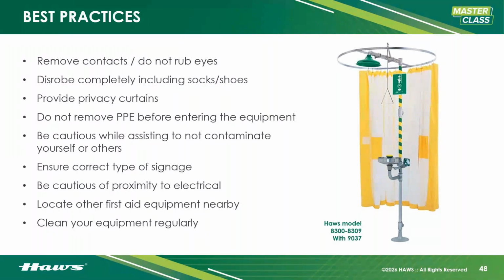Make sure to disrobe completely, including your socks and shoes, which brings me to please provide privacy curtains. This is often a horrible day for the victim under the shower or the unit, so we really want to make sure that we're providing some decency to them. Next is do not remove PPE before entering the equipment. It's there for a reason, so make sure the unit is activated before you take that off. Be cautious while assisting to not contaminate yourself or others, so shouting directions is very useful in those situations.